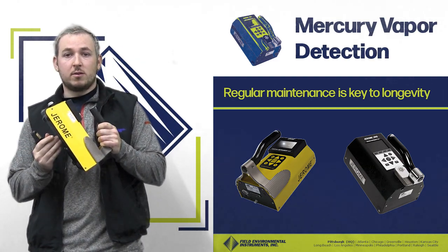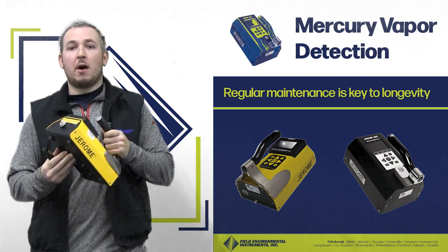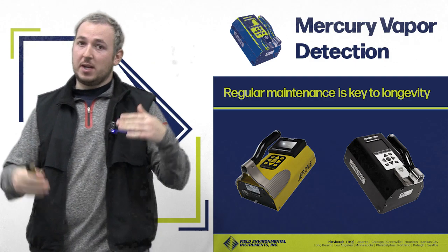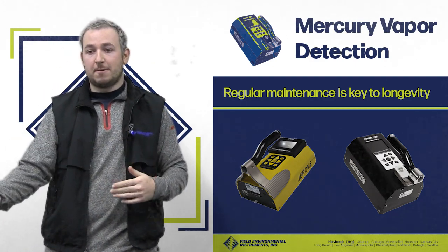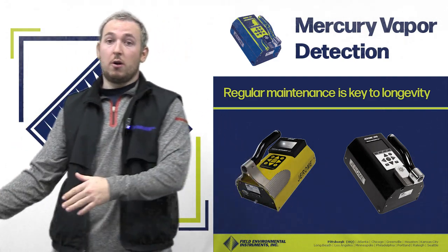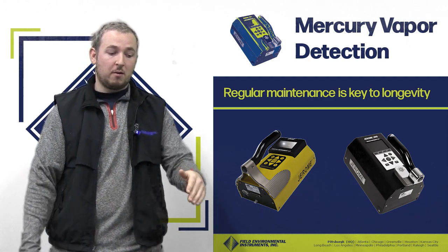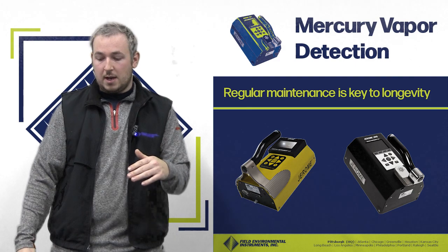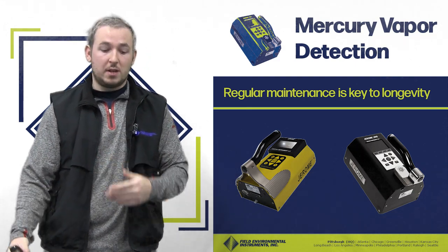So with the gold sensor, that sensor does need field regeneration every once in a while. I would recommend doing that at the beginning or the end of the day, as it takes about 45 minutes to an hour and needs to be plugged into AC power as it does that regeneration. Both of these units also go in for annual calibration to Jerome. So anytime you get a unit from Field Environmental, you can be guaranteed that these will be in factory calibration and within those standards.